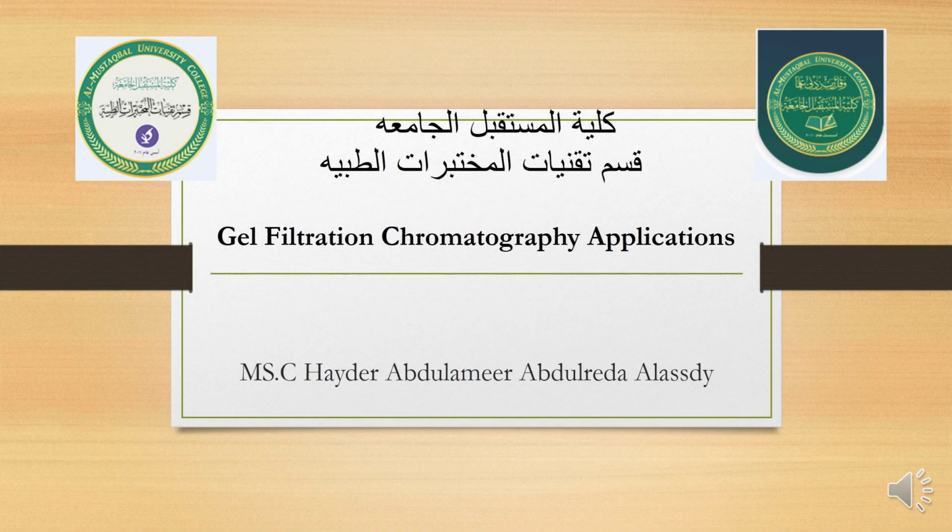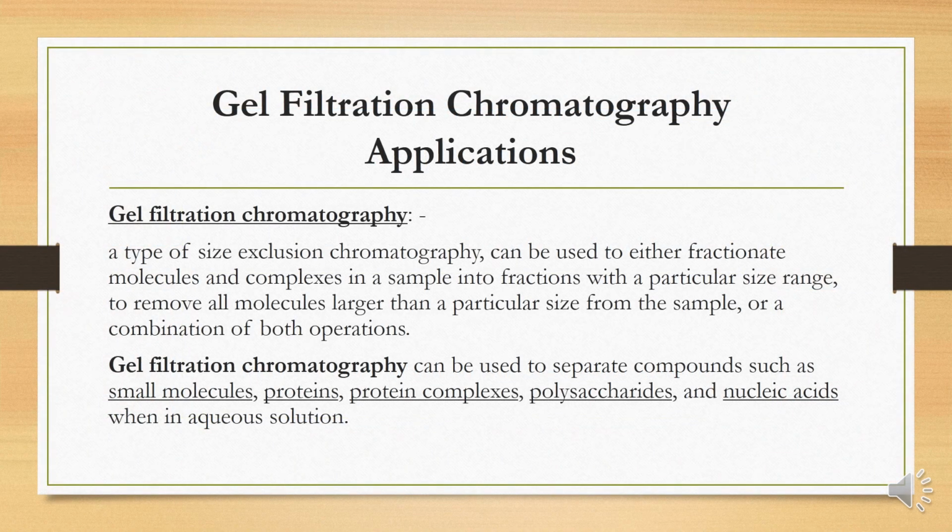Gel filtration chromatography application.